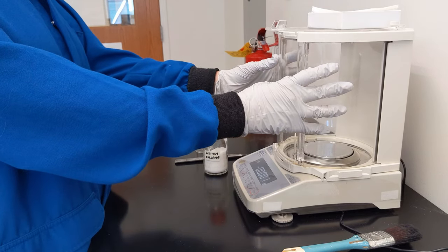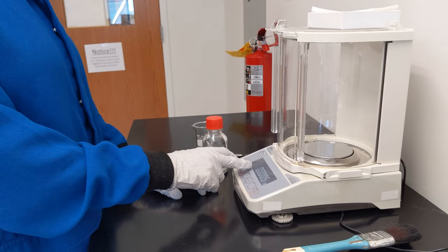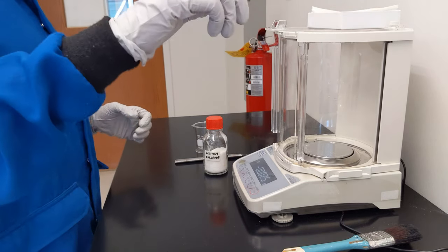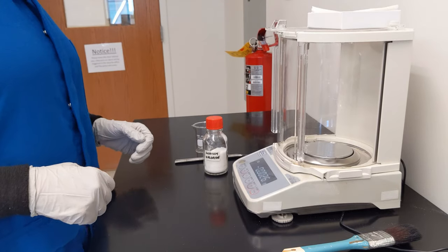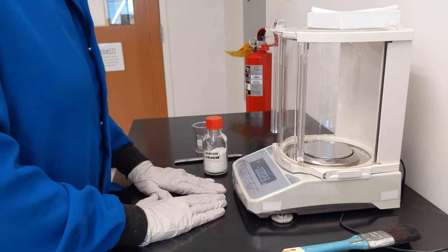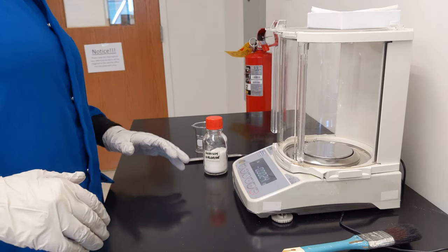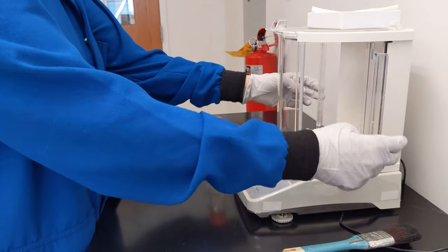There is also a wind guard on this. We have a level of precision of 0.0001 grams — that is precise enough that air movement in this room can change the reading. It is also precise enough that if I start pushing on the lab bench, you might see the last digit or so changing. That means that whenever we go to zero it or read a value, the wind guard panels need to be closed.